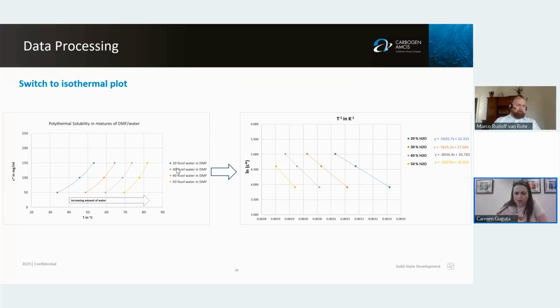Have you ever experienced polymorphic conversion and been able to detect it by a transmissivity profile change? Like hydration, solvation? Yes.